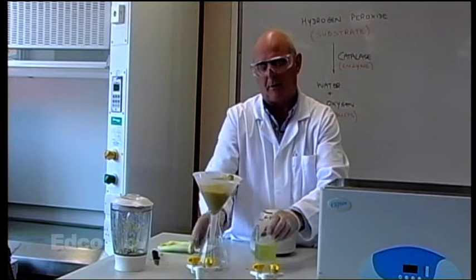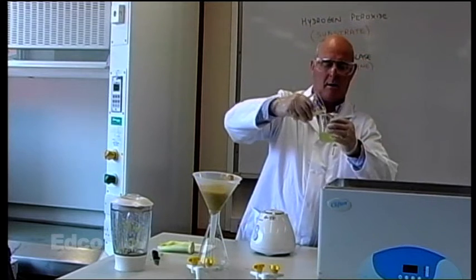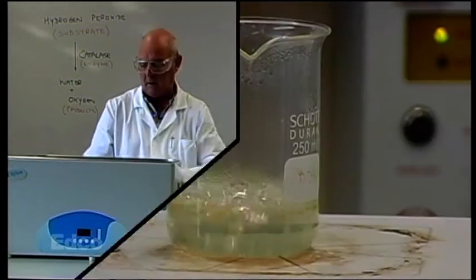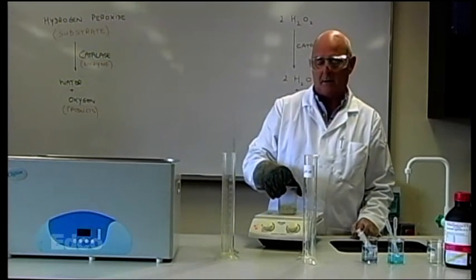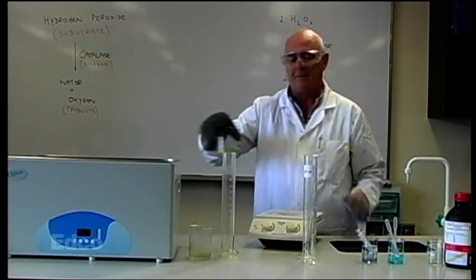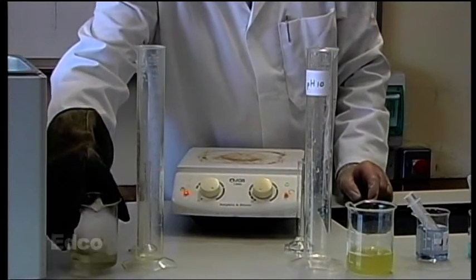And this time we want to take half of this and boil it. So we take half of this solution into a beaker and we'll boil it. Having allowed it to boil for a number of minutes, we remove it from the hot plate and we place it there. And we take our unboiled solution. On this side we have the unboiled enzyme, and on this side we have the boiled enzyme.